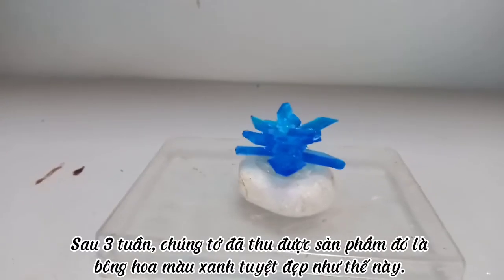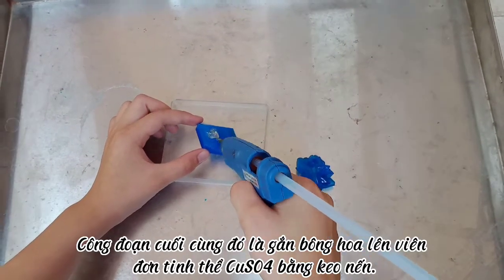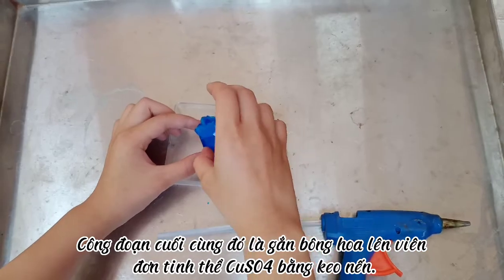After 3 weeks, we got a product which is a beautiful blue flower like this. The last step is to attach the flower onto the copper-2 sulfate single crystal with hot stick glue.